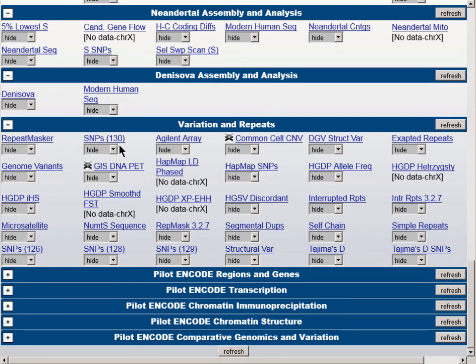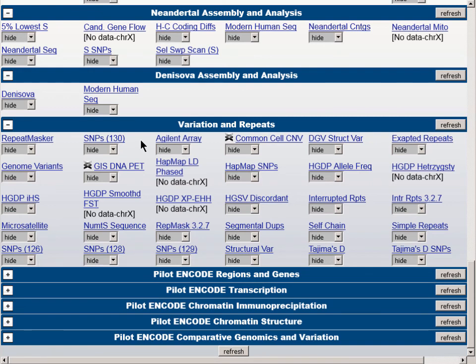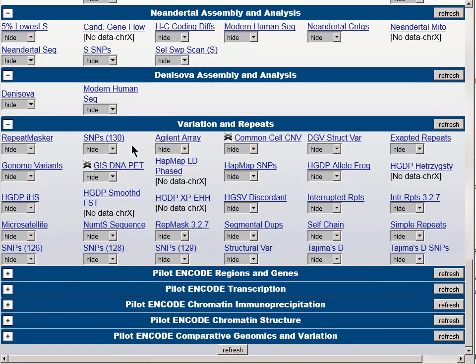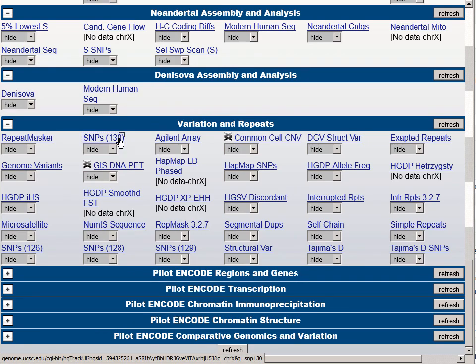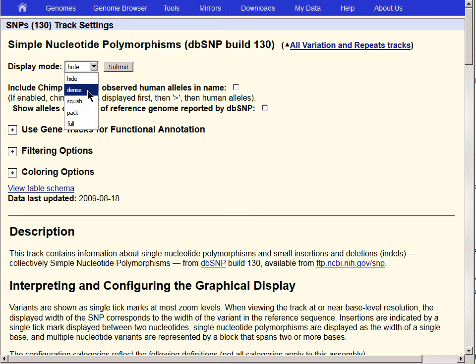In addition, we have earlier versions: 129, 128, and 126. At the time of version 130, before moving to HG19, dbSNP was mapping all new SNPs to the HG18 genome assembly. If we click into the link above the pull-down menu, we can see that this table was last updated in 2009. We're going to turn the track on to Dense, and then Submit.